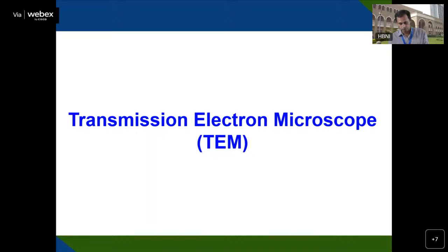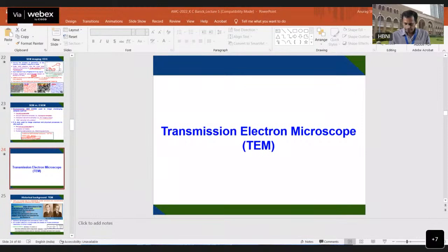So the SEM that I have discussed mainly deals with scanning properties, where you have a raster scan and see the electrons, giving the material characteristics. If you have any questions on SEM, we can discuss here for one or two minutes, and then we'll go to the transmission electron microscope part. If any question, you can raise it in the chat box, especially on SEM.